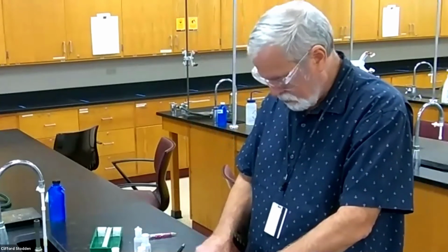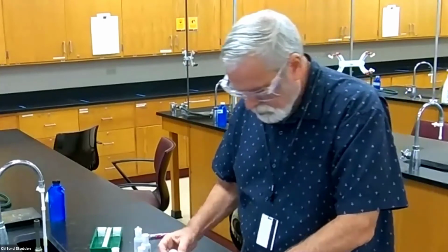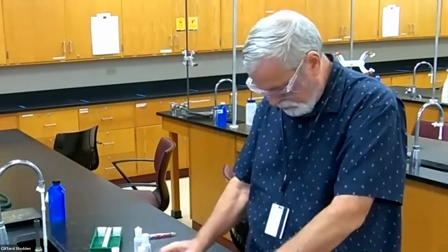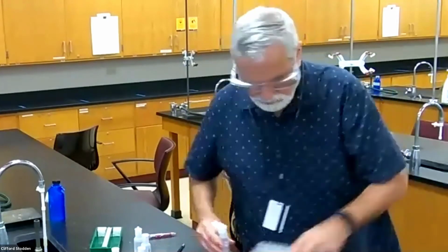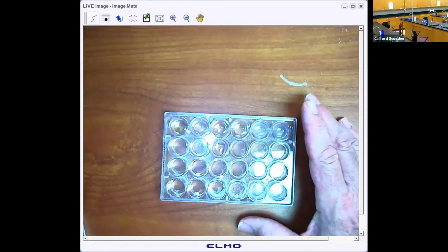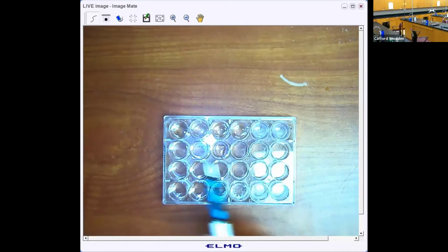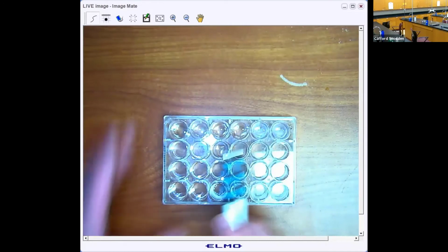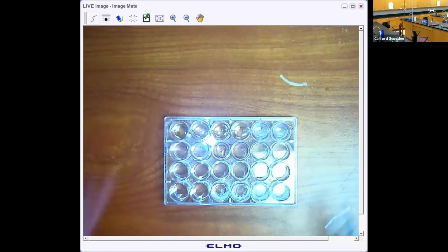And then finally sodium hydroxide with aluminum. And I have 3 drops of that also. So let me show you what we have. Across this row here has the aluminum in it. The first 4 that I added, nothing happened. There was no precipitate. These last 2, though, you can see from there that they're a little bit cloudy.